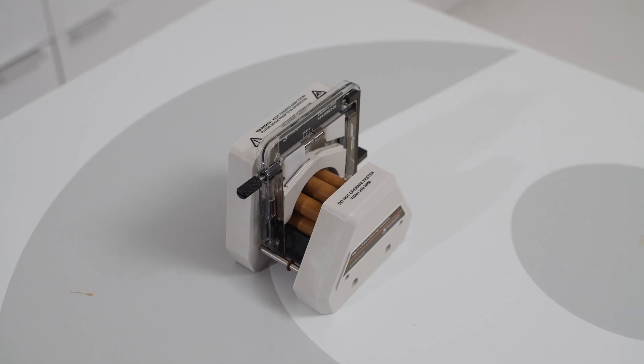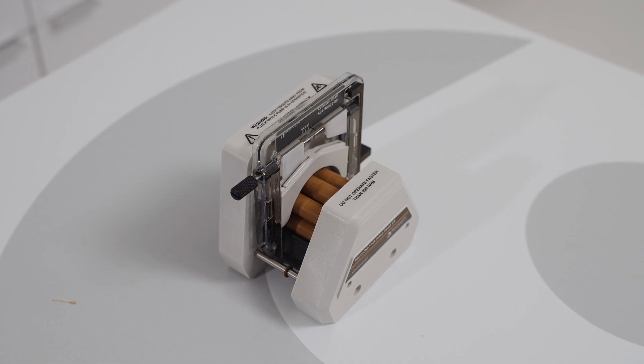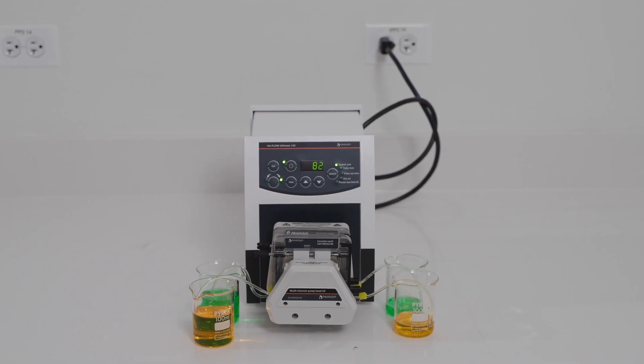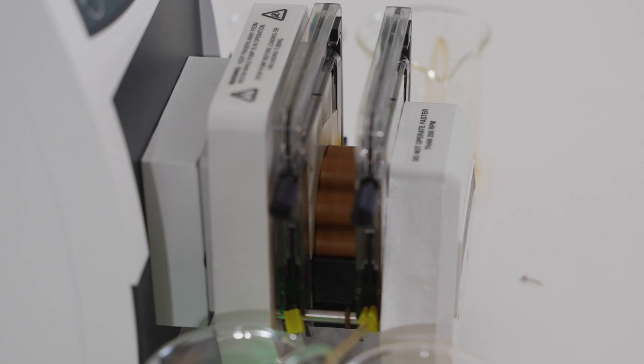The first multi-channel pump head is called the C4. The C4 is able to accept four small cassettes, meaning you could pump four different liquids at once. The C4 is constructed of an eight roller system which allows for a very even distribution of your fluid.